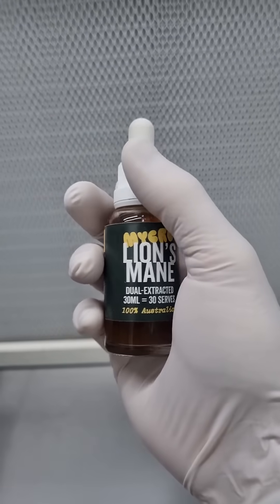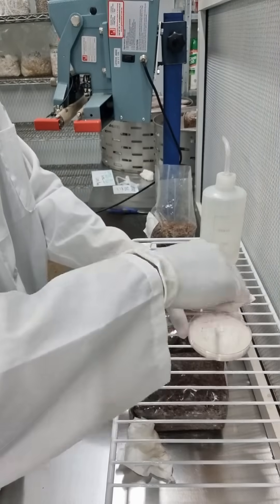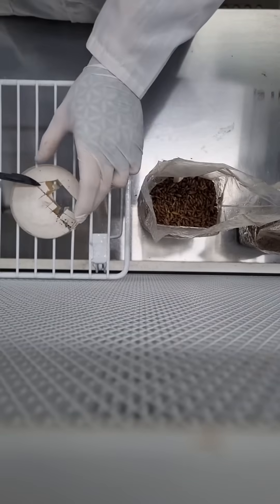Here's a quick look behind the scenes at how we grow the mushies that go into micro products. We start out with a mushroom culture grown out on a nutrient plate, and we transfer sections of that mycelium into jars or bags of sterilized grains.